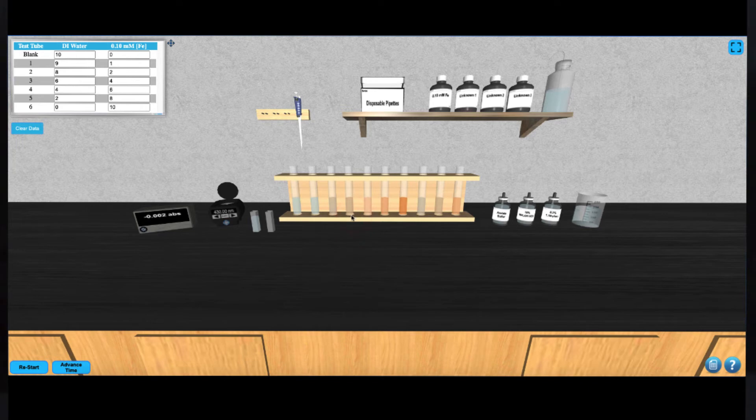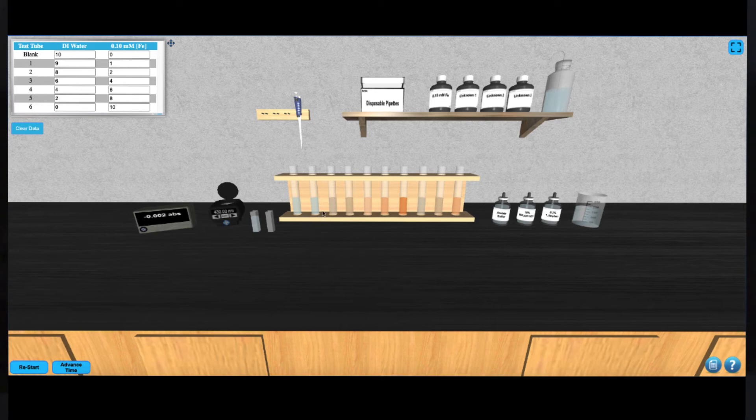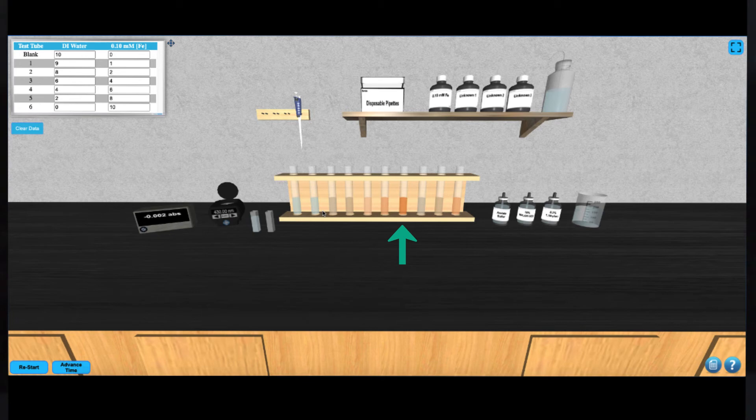Now you're ready to take an absorbance measurement of your other solutions. To do this, you'll need to select an optimal wavelength to use for this experiment. This can most effectively be done using the solution from test tube 7, which is the most concentrated in iron, and therefore the darkest.